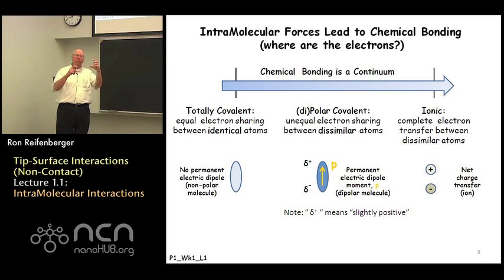And these dipole moments are then free to interact one with respect to another to produce a net attractive or repulsive interaction. And ultimately, these dipole moments are going to lead to interactive forces between a tip and a substrate in atomic force microscopy. So these are things that you probably understand if you've taken an introductory course in chemistry. But I just thought it would be worthwhile to summarize these ideas in this first lecture of week 1.